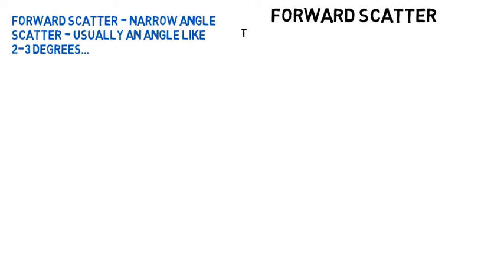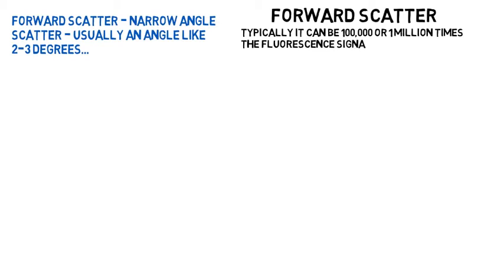We mostly collect this at about 3 degrees angle off the laser beam. FALS signal strength is very large. It can be 100,000 to 1 million times the intensity of the fluorescence signal.